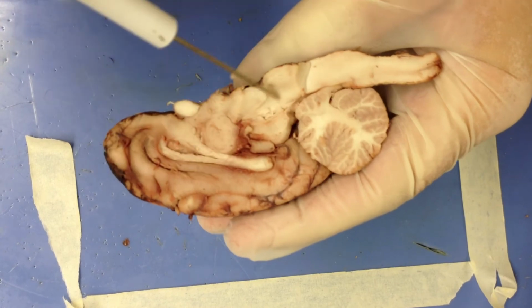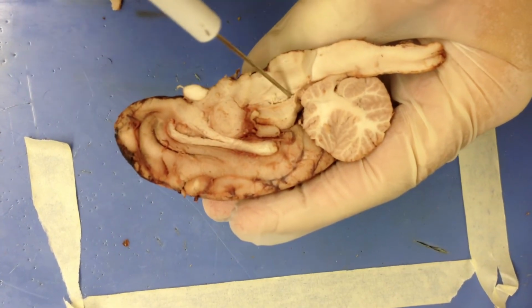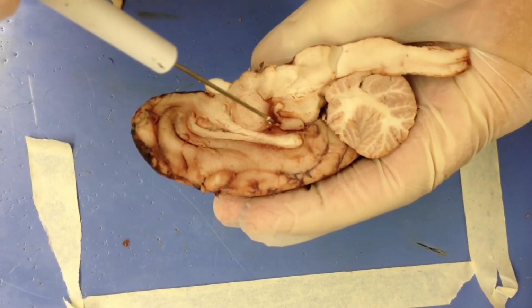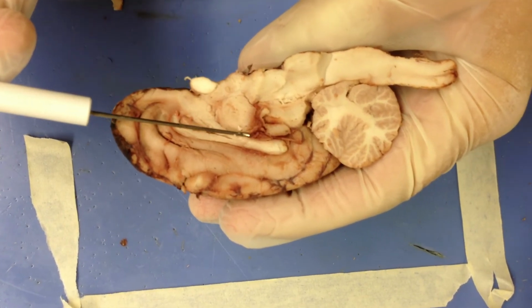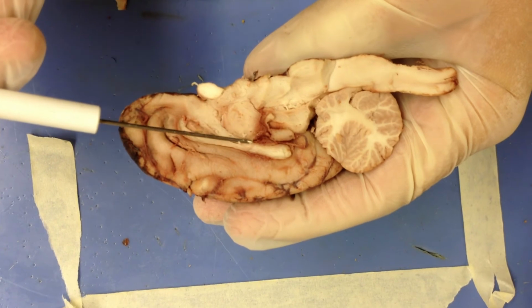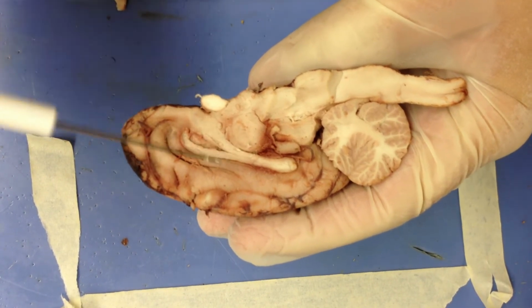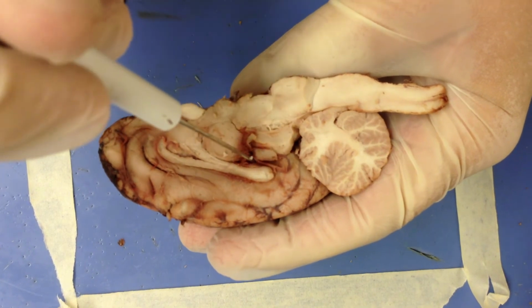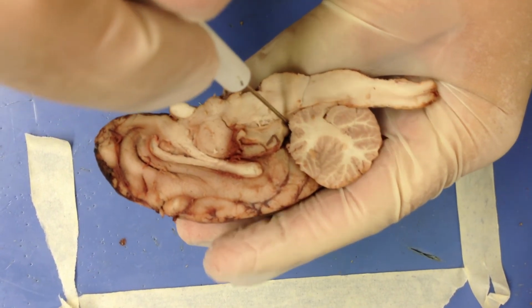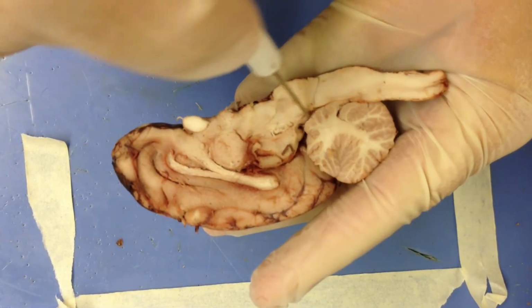So this section right here is going to be the aqueduct of Sylvius, right below the pineal body, which is right here. And the habenula, you cannot see in this section, but it's a small piece that's usually going to be right about here. The third ventricle is going to be right above here, which takes you right down. You can follow the ventricle all the way down into the fourth ventricle.